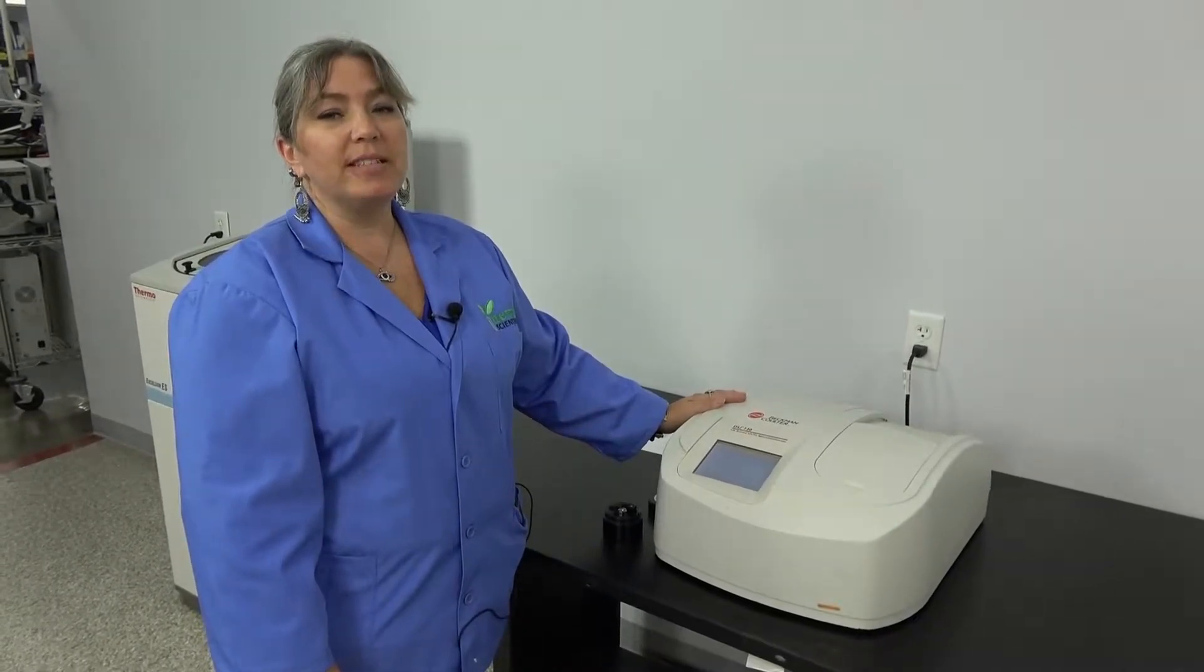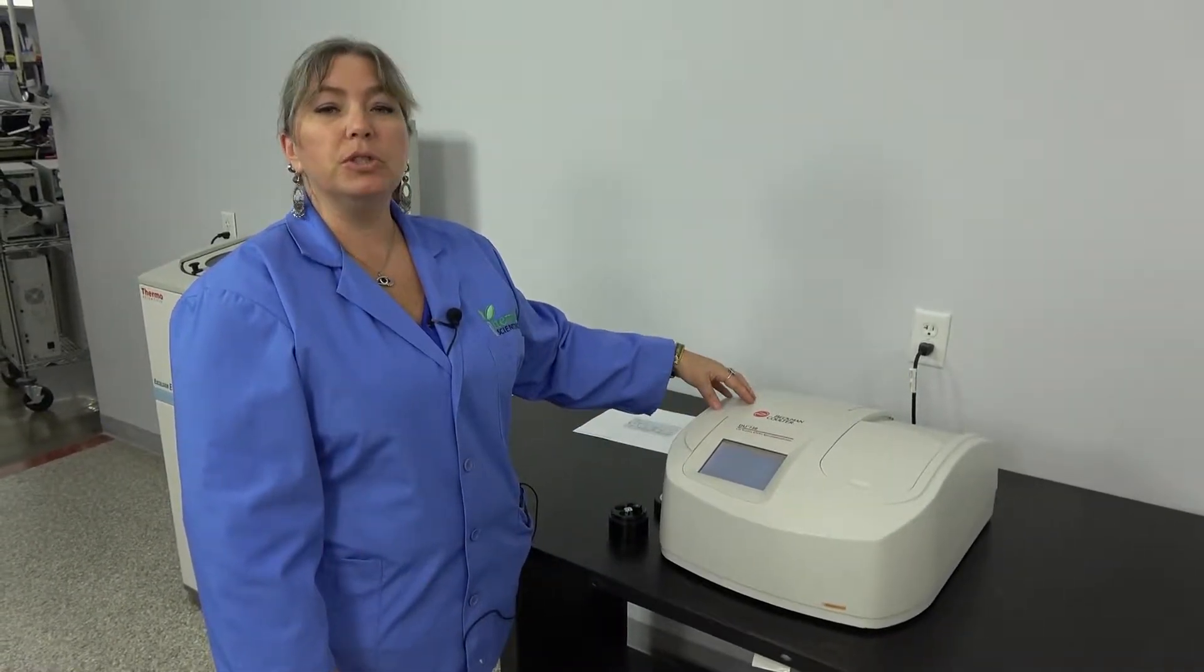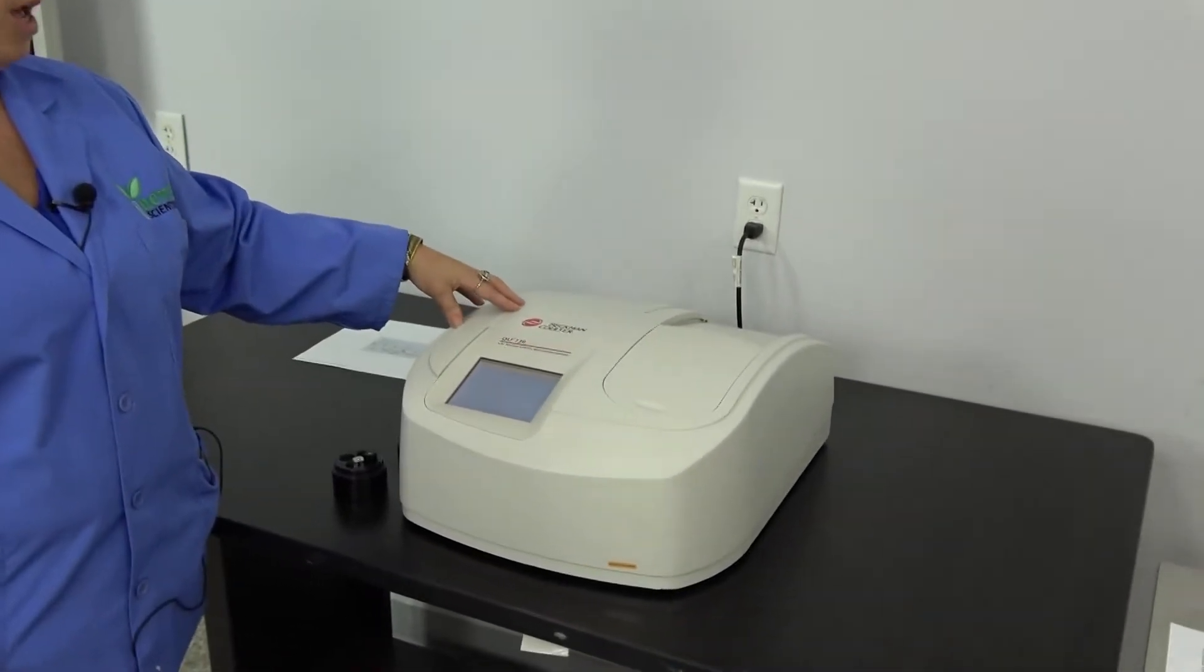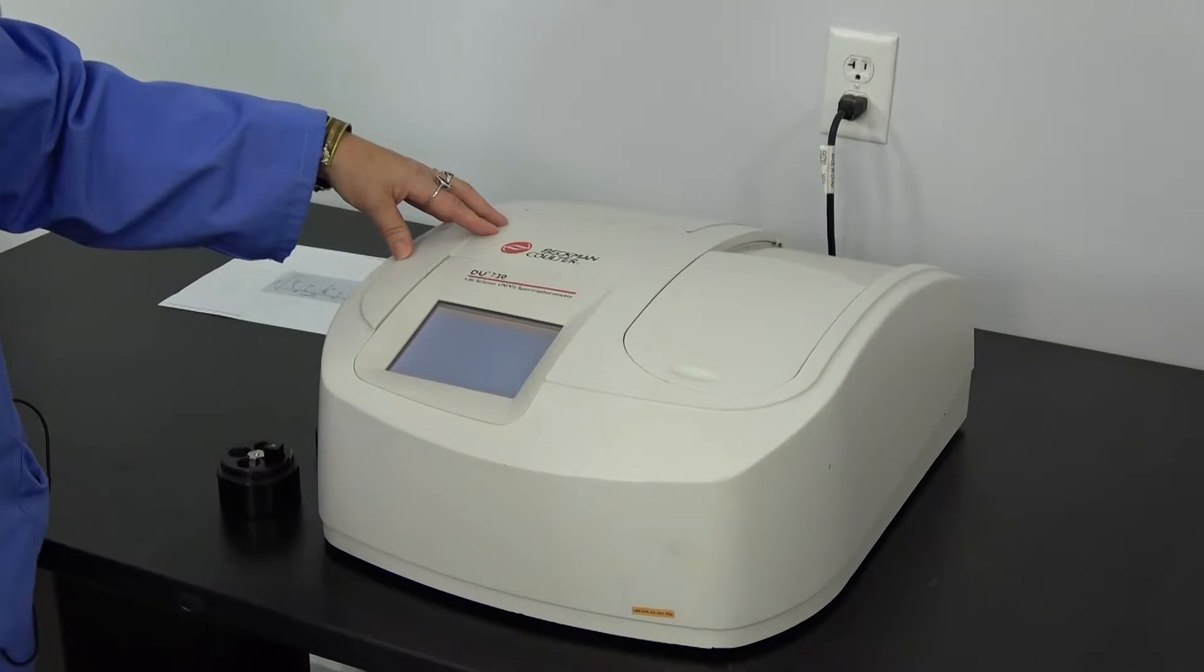Hi, I'm Lori and we're at New Life Scientific taking a look at the Beckman Coulter DU730. This is a UV-Vis spectrophotometer. It can be used a lot in life sciences applications.